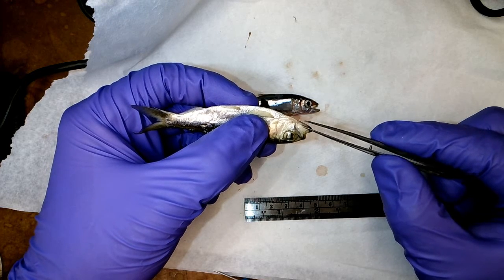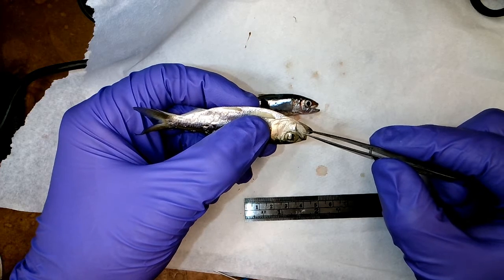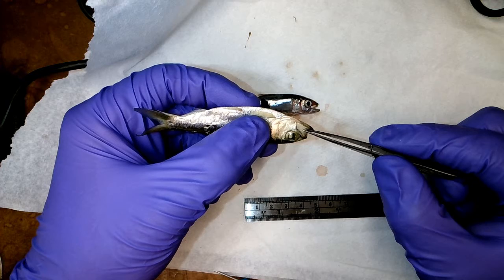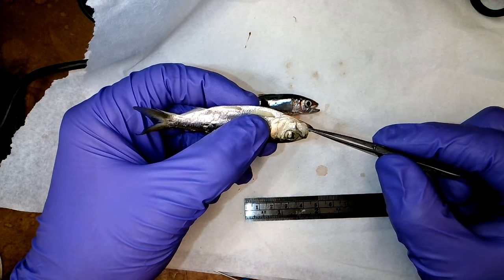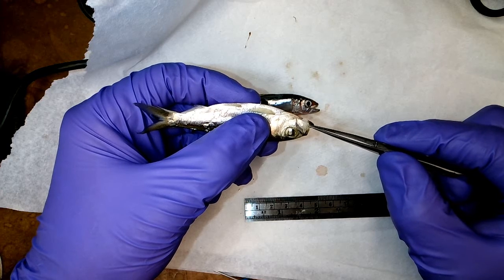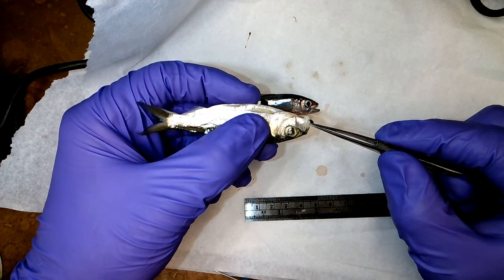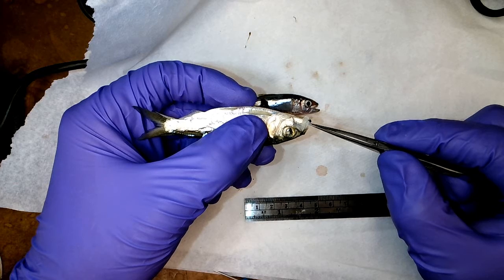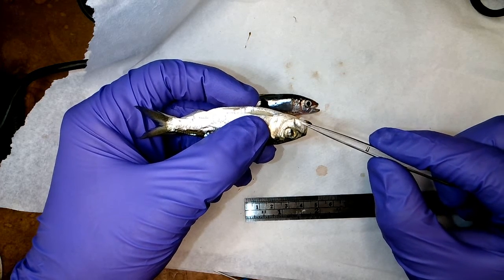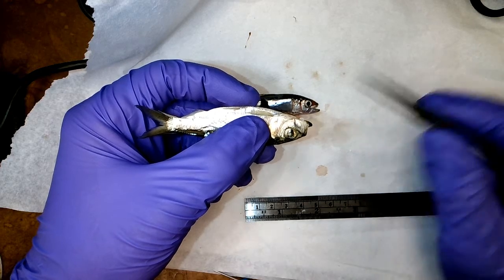So our codes are 0, 1, 2, but we can modify that to say rounded or squared. But you can see, if you separate that and have a decently contrasting background, you can see how this is slightly teardropped here and not rigidly rectangular.